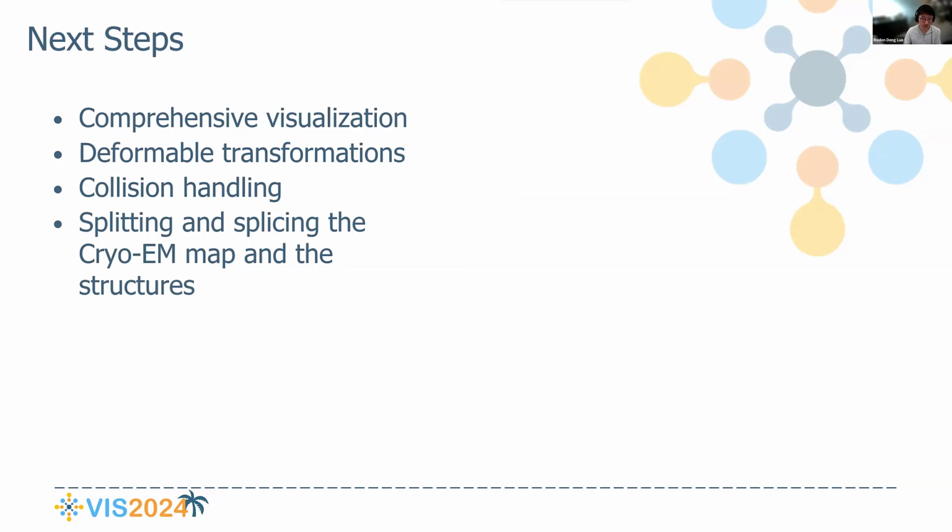We are extending DiffFit to include a comprehensive visualization solution, deformable transformations, collision handling, splitting and splicing the cryo-EM map and structures.